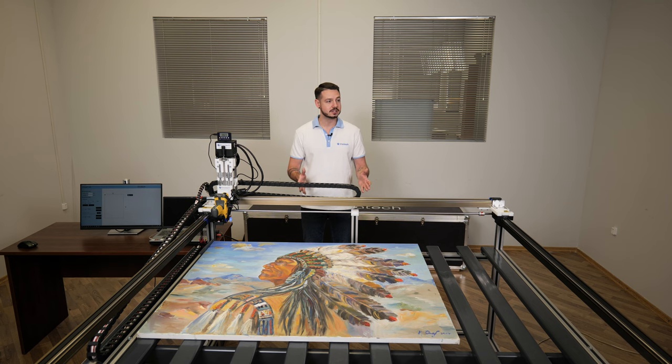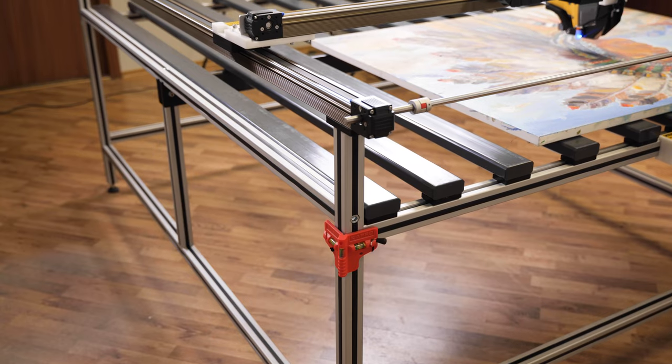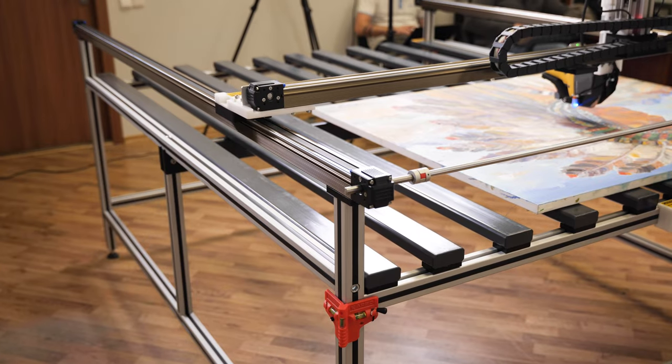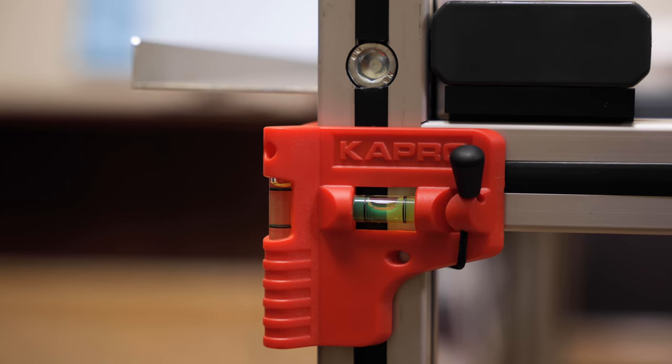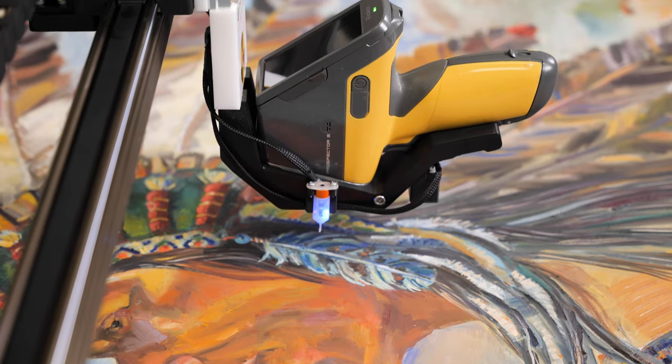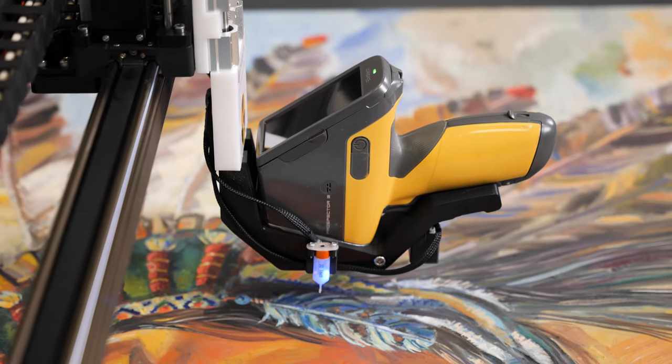Here you can see the Elvox Art analytical system on a special 1.5 x 2 meters aluminum frame table. This design is specifically engineered for ease of operation and analytical accuracy. The frame not only provides stability and reliability, but also allows you to easily mount the Prospector 3 analyzer for optimal analysis conditions.